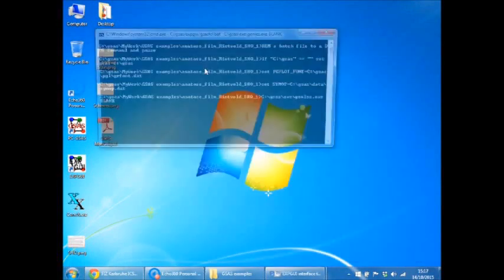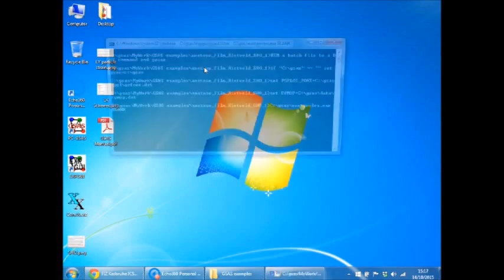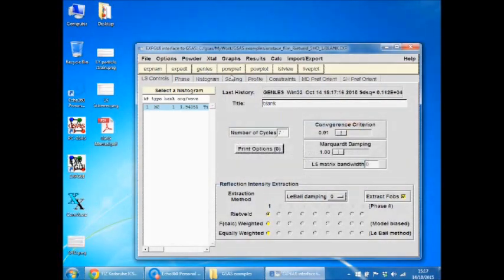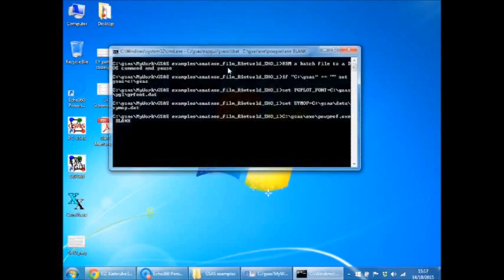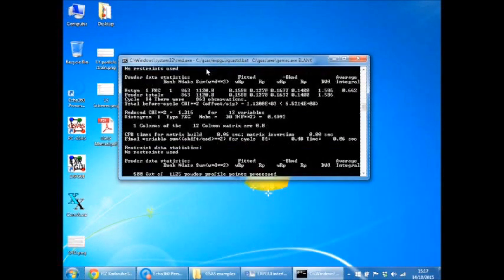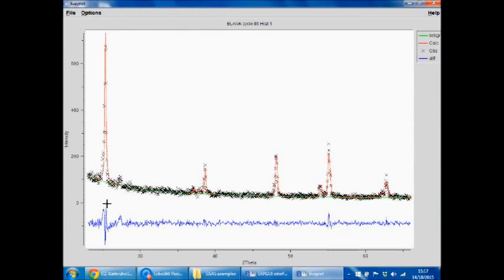It's improving, but steadily. And again, you just go through many iterations of this until you reach a true minimum. And that's not bad. That's very good actually.